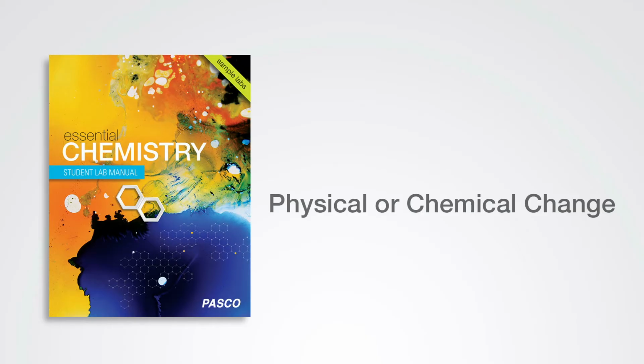Can you tell the difference between a physical change and a chemical change? This is our physical or chemical change lab. Chemistry is the study of matter and the changes that matter undergoes. Some of those changes are physical and some of those changes are chemical. What is the difference between the two of them?